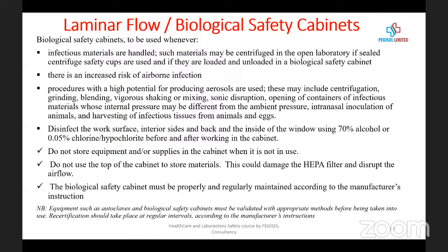So you can see some people just put things on top of the biosafety cabinet because they want to maximize space or use it as a cupboard. No, you don't do that. The safety cabinet must be properly and regularly maintained according to the manufacturer's instructions. So there must be periodic maintenance for the biosafety cabinet.